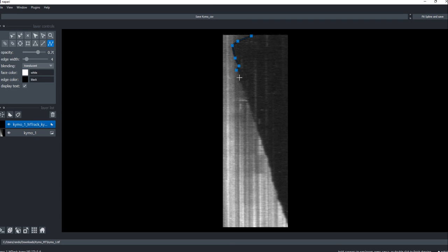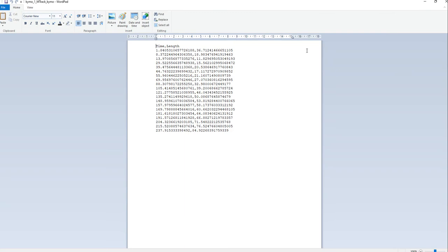So what I'm trying to do here is extract these boundary points, convert them into a CSV file, and load that CSV file into MTrack Ransac mode, where you can then do these automated fits to get the growth and the shrink rates. So once you have done your clicks, you can save the sparse points that you just made by using this save functionality, and it's going to save your sparse clicks over here.